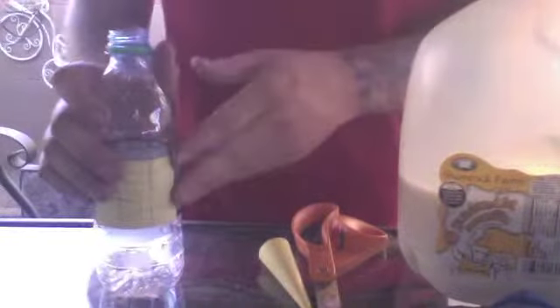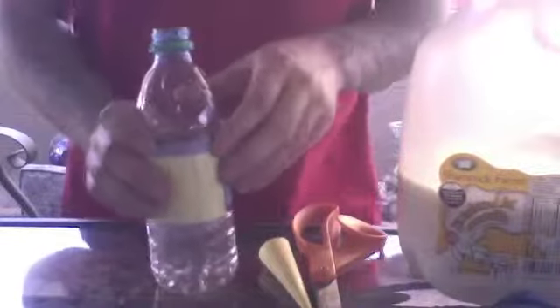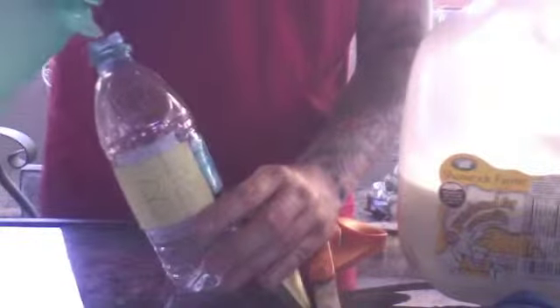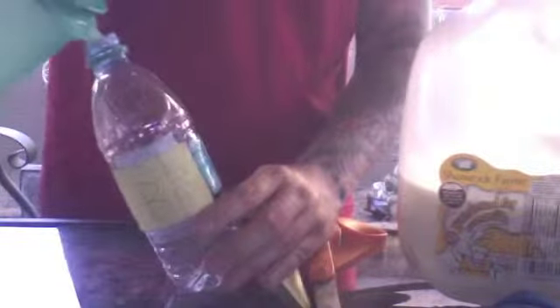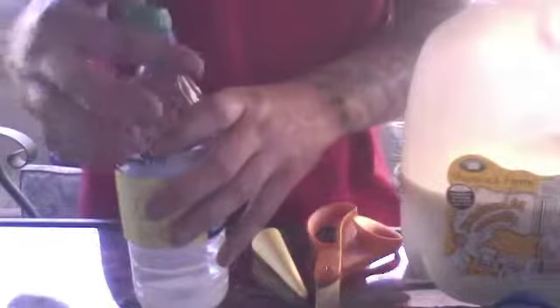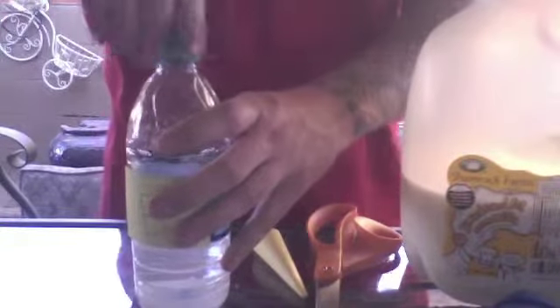Now for the next part, we're going to be doing one of the negative controls. This is going to be the sugar only. It's not going to have yeast, so again we're going to fill it about a third of the way with warm tap water. And we're going to put a quarter cup of sugar in it. And we're going to cap it. Shake vigorously for 5 seconds.